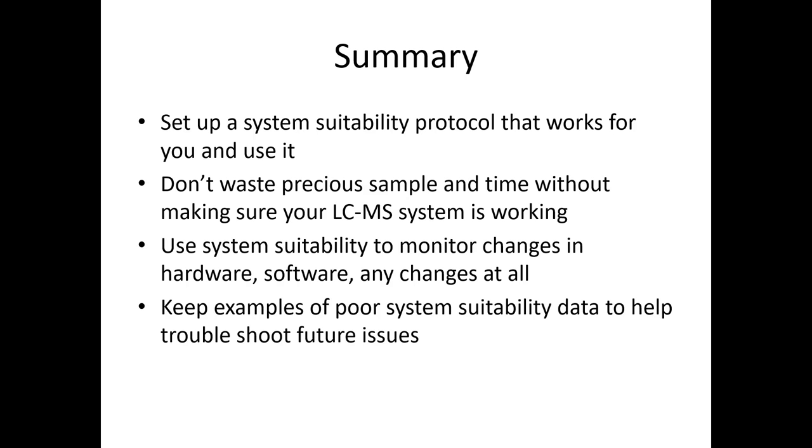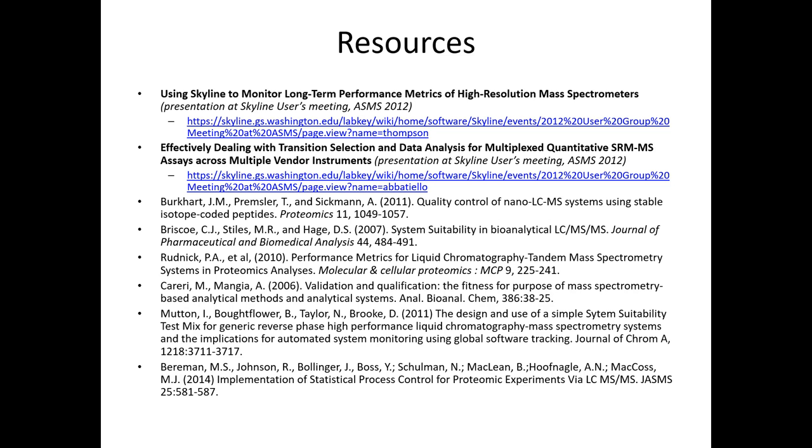If you have a picture of a chromatogram, a peak shape, changes in mass accuracy, or output from a data-dependent peptide search, then you can write down what you did to fix that problem and keep it in a notebook. If it's something that occurs frequently, stick it on the wall next to your instrument. It's very helpful, particularly if you have new people coming into the lab and you want everyone to be on the same page.